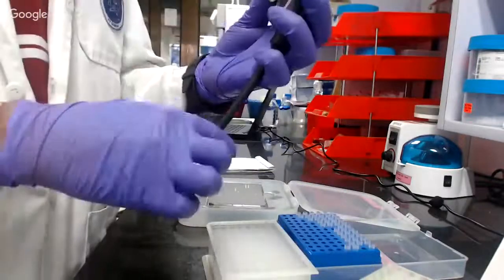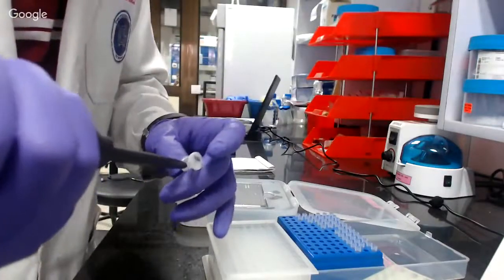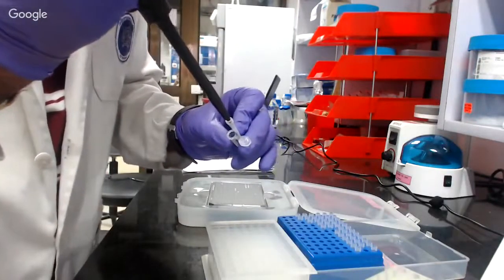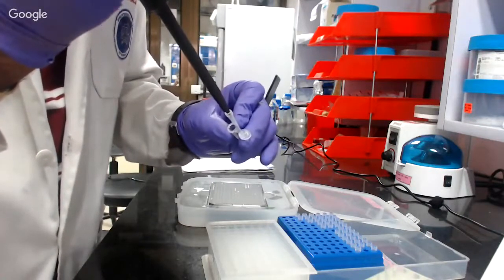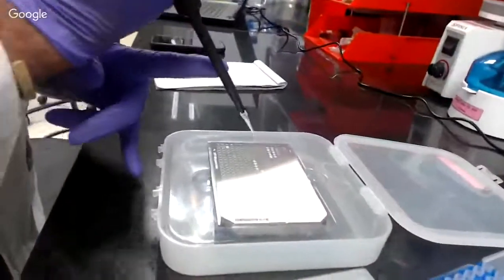The matrix for the peptide is HCCA matrix. So I'll take 2 microliter. So basically I'm taking equal volume of the matrix and the sample. Then I will dissolve properly. Then I will take 2 microliter of the sample and then I will spot.